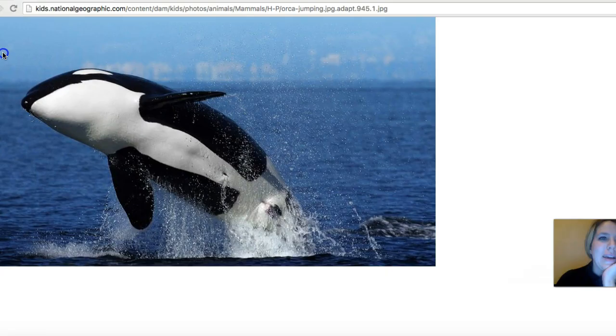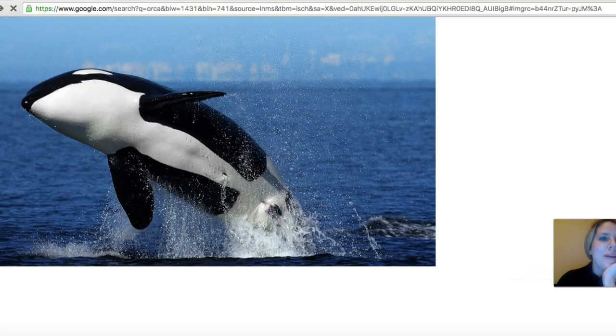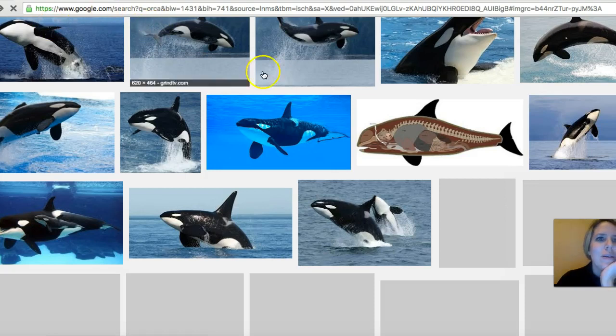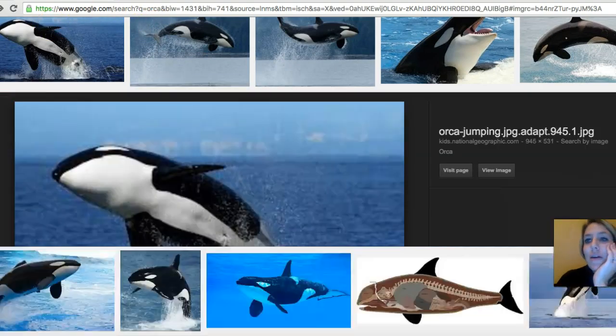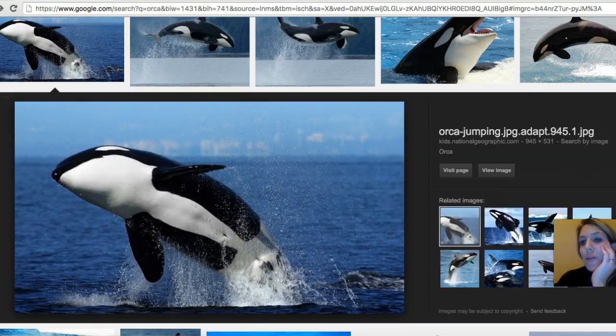I'm going back down the size. I'm going to go back and find my next critter here. You probably want to type in the species names.